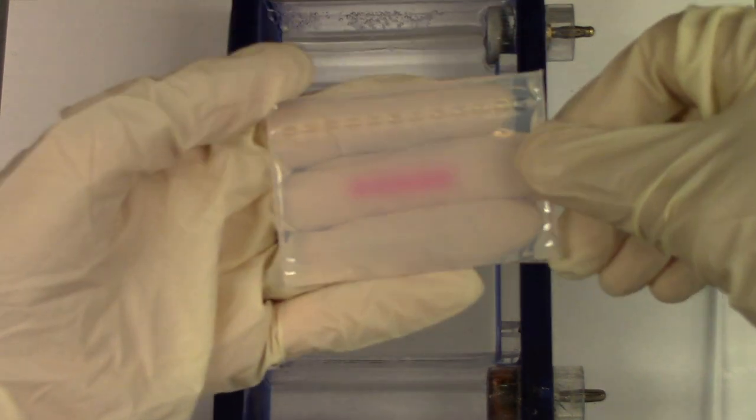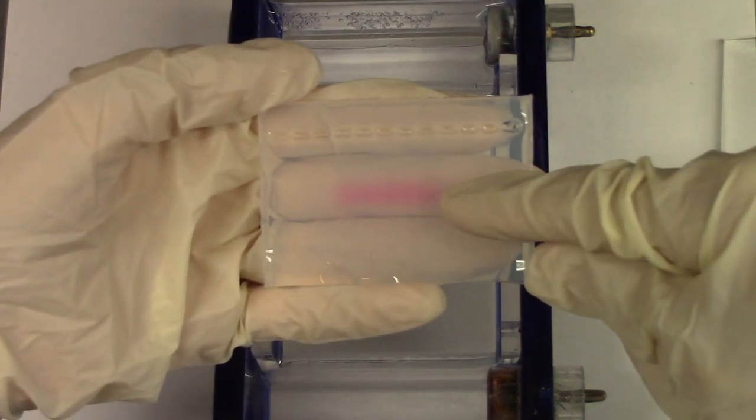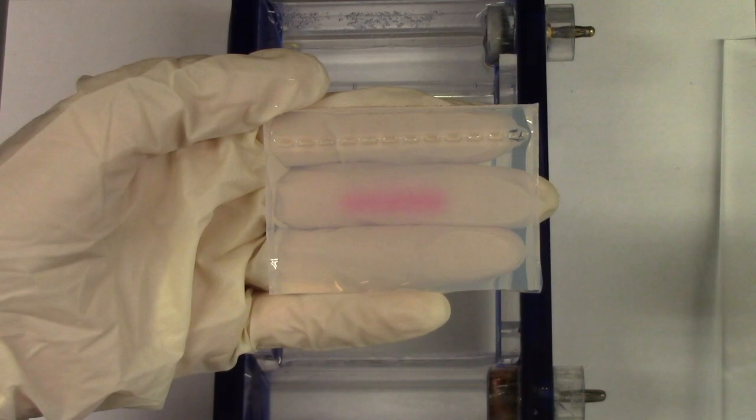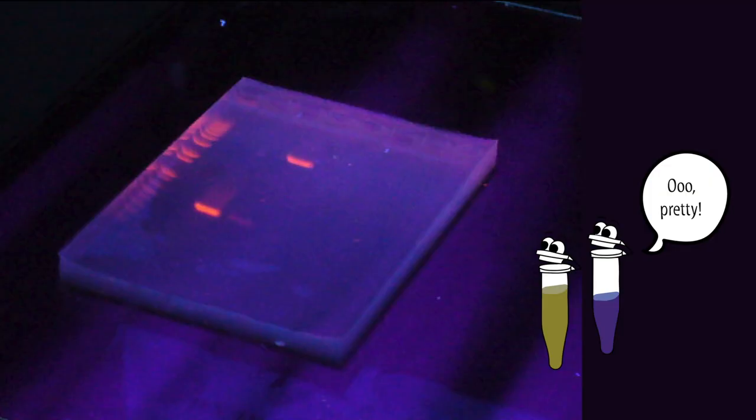After about 30 to 45 minutes of running the electrical current, we can look to see where the pieces of DNA are. Now the purple stuff there, that's the loading dye, that's not the DNA. To see the DNA, we use a stain that binds to DNA and fluoresces under UV light.